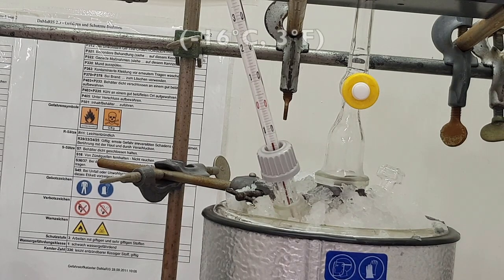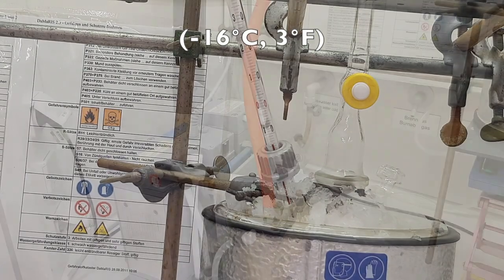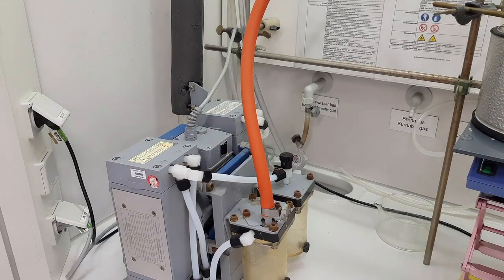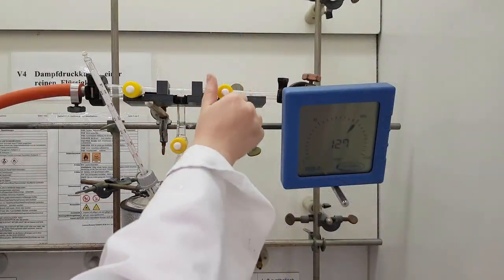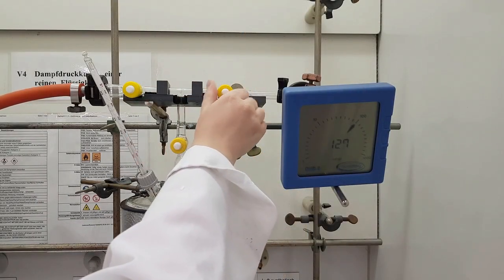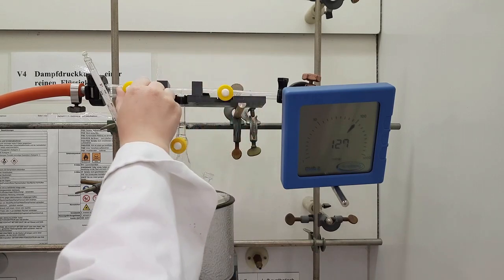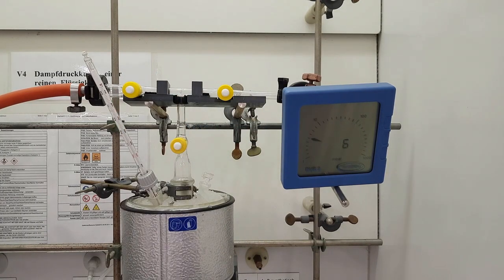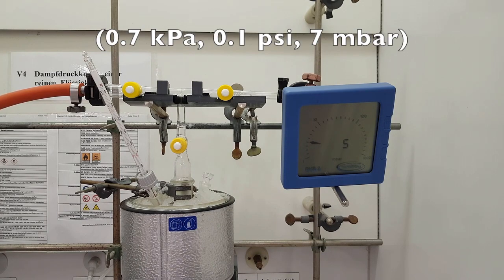As soon as negative 16 degrees Celsius is reached, the vacuum pump is switched on. Open stopcocks 2 and 3 with stopcock 1 closed. Wait until the pressure gauge indicates a pressure of less than 0.7 kPa. Then carefully open stopcock 1.